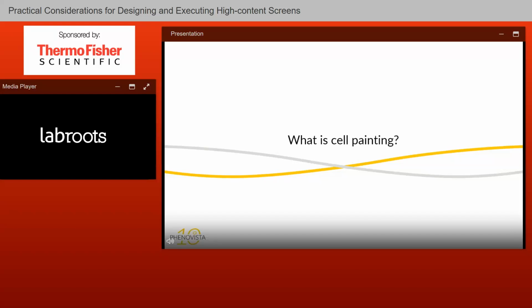Okay, a final example is something called cell painting.